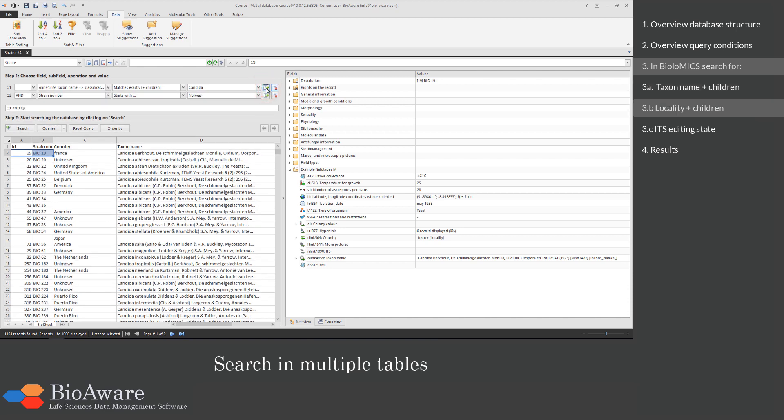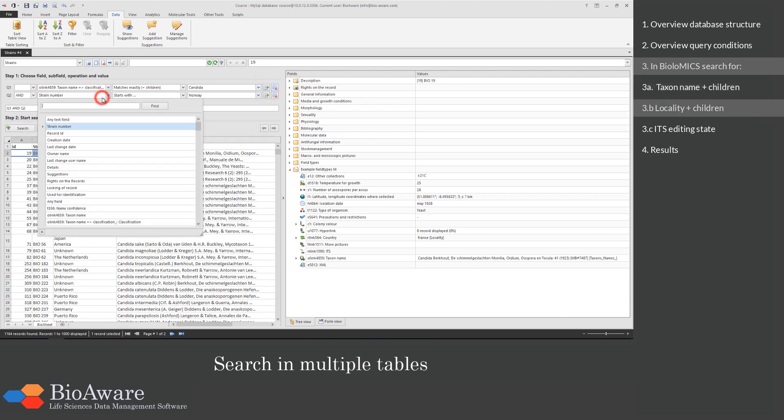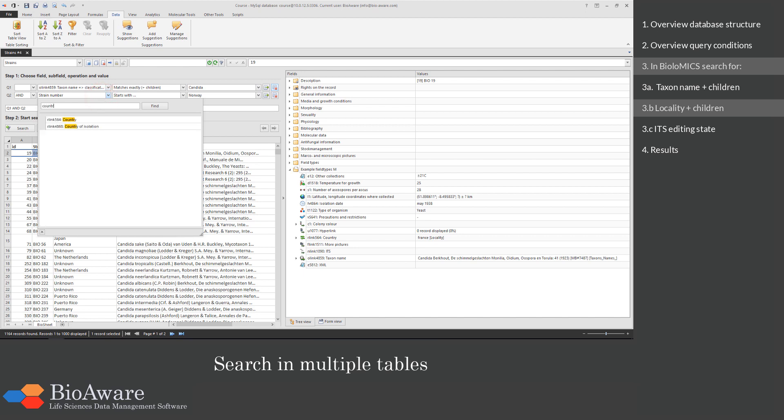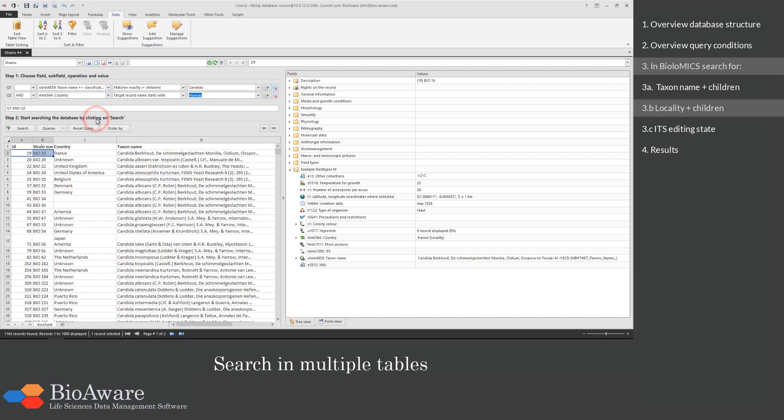Then we move to the locality which is the country field in this database. We are going to search in the locality table.